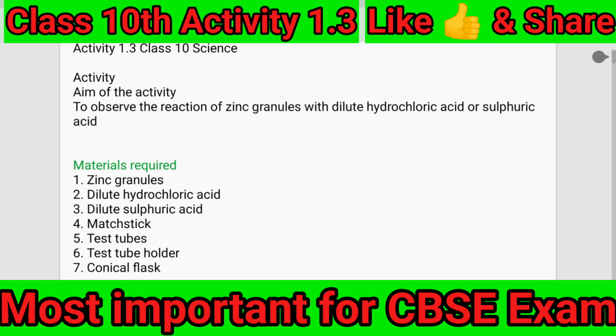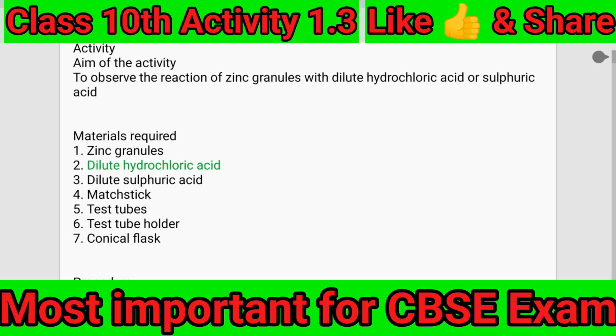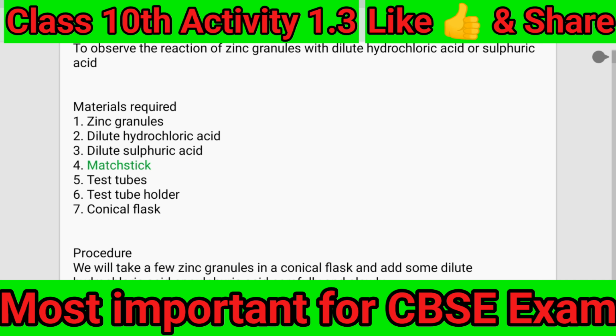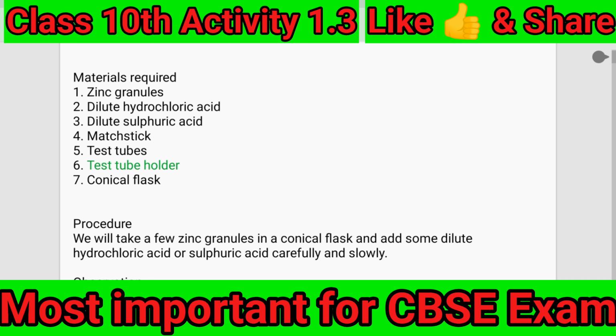Materials required: 1. Zinc granules. 2. Dilute hydrochloric acid. 3. Dilute sulfuric acid. 4. Matchstick. 5. Test tubes. 6. Test tube holder.